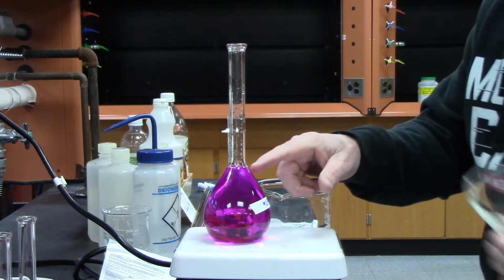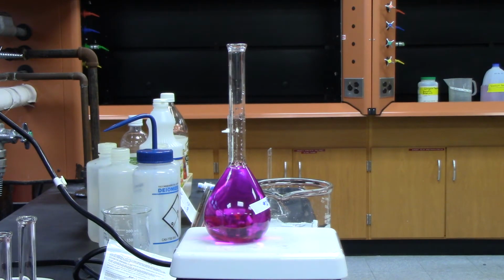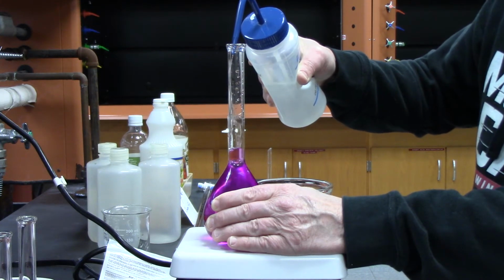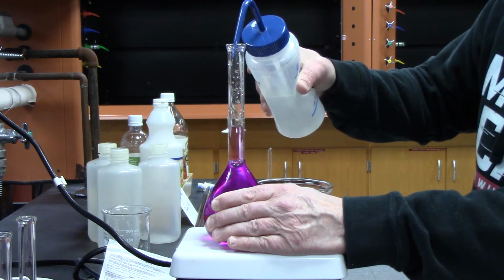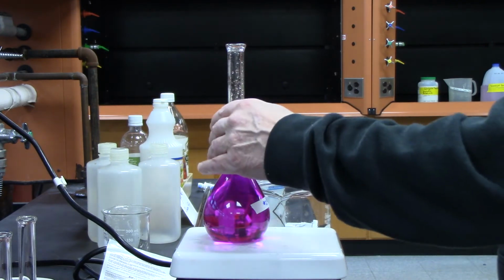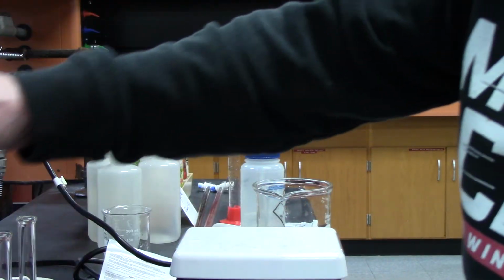Because if you're sloppy and you're adding it fast here, it'll start going up really, really fast. Now I'm going to get the final volume up with my water bottle. Again, I need to add, slow down. You want to get that neck water. There's actually a lot of little drops of neck water that kind of mess things up, but that's good. Now I'm going to mix it up, put the top on it. And there you go. There's number 2.